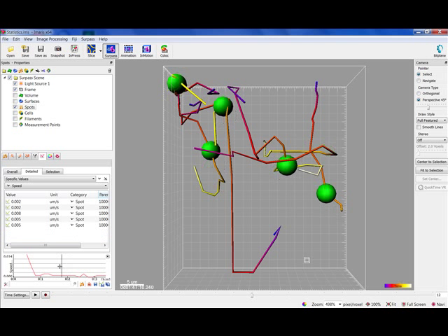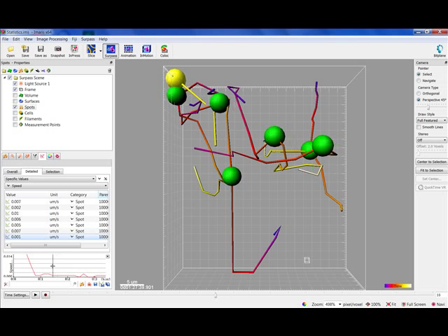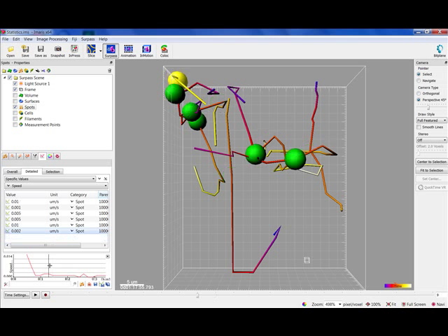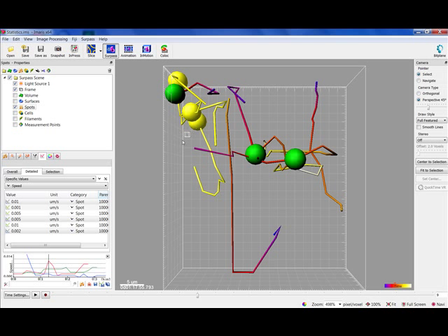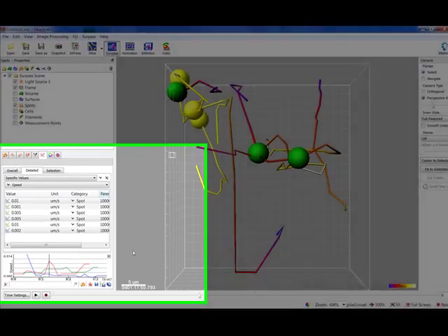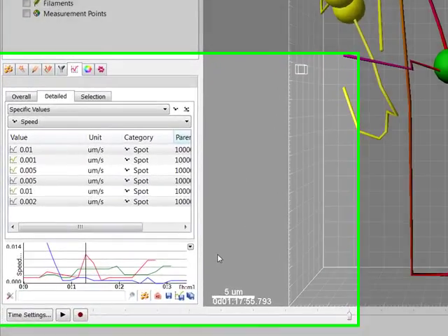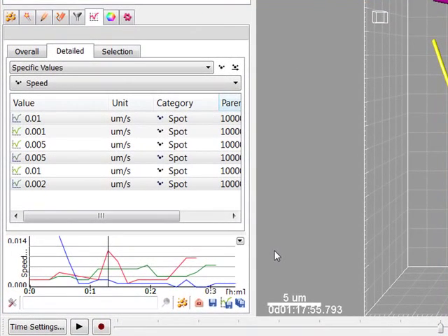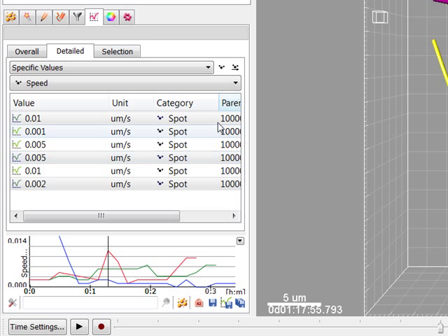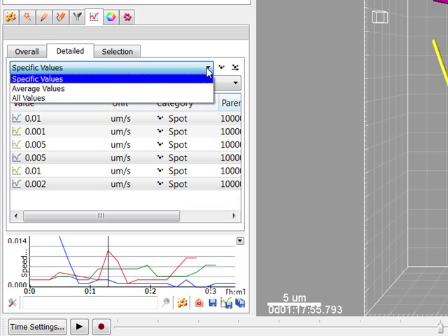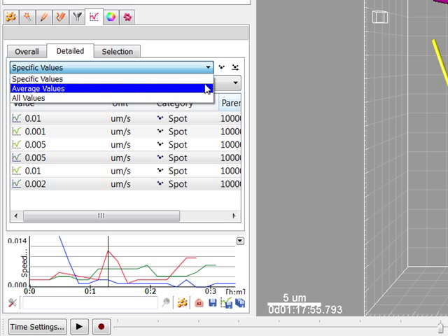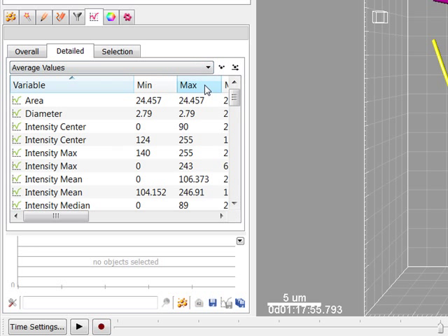Selecting more than one object using Control and Left Click updates the graph and the plot now shows the overlaid values. Imaris can also calculate and display graphs that represent the average values for each parameter of all the objects at each time point. To visualize this graph, choose the Average values option.